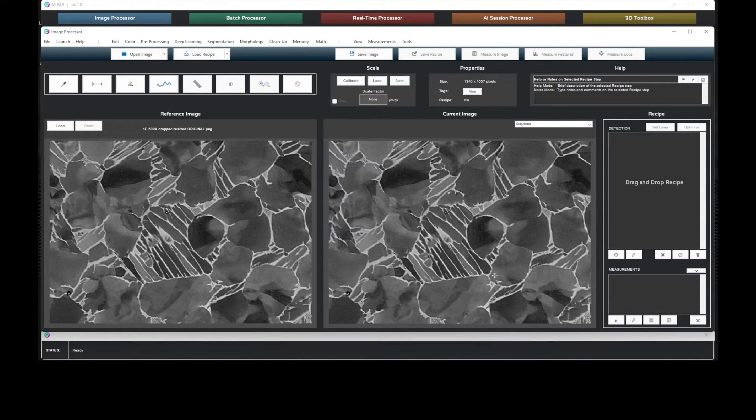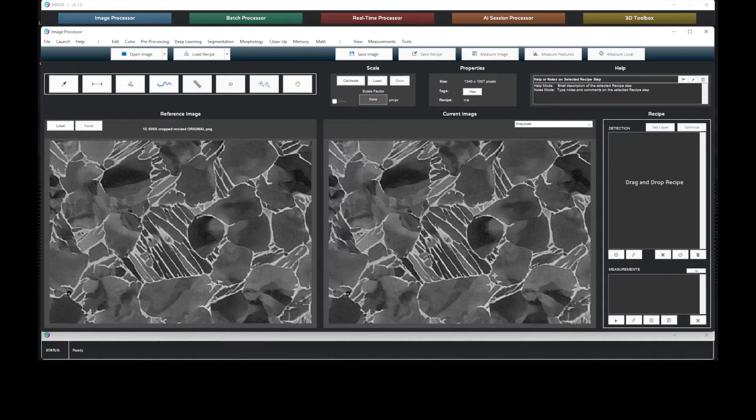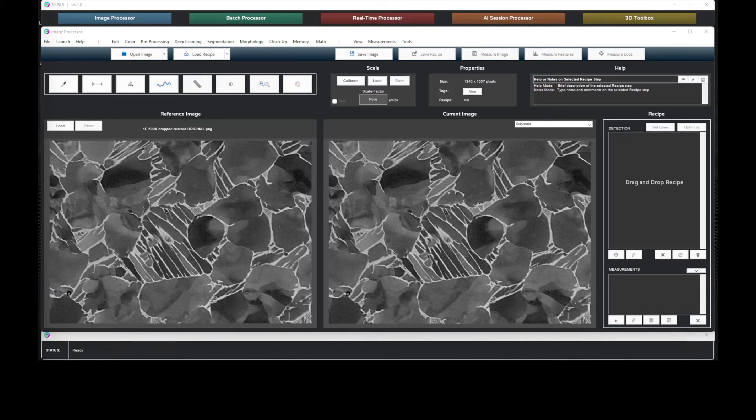In the past, this analysis would be done manually. An operator would annotate the image with all the phases of interest. This manual process was prone to error and it was extremely time consuming.